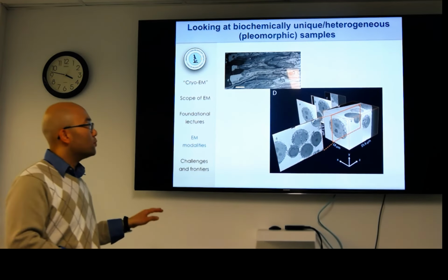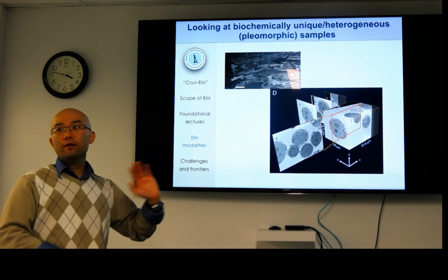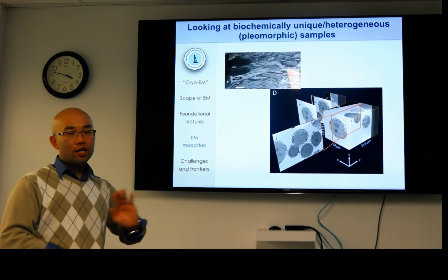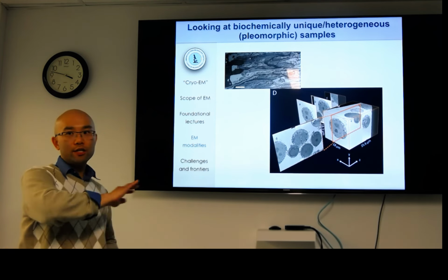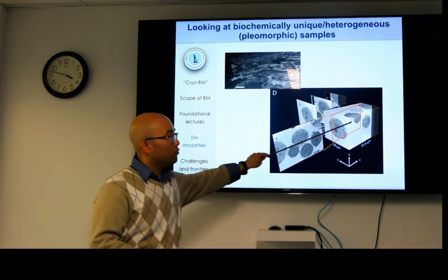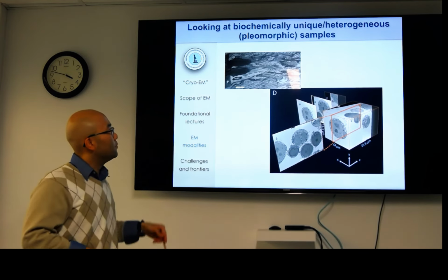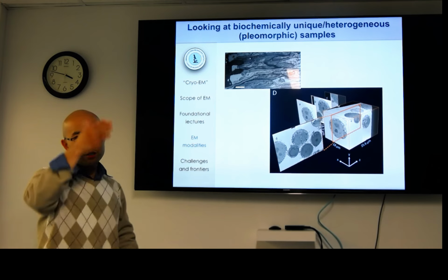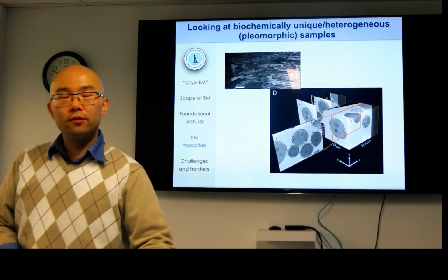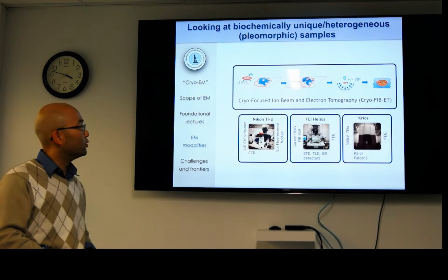So that's classical tomography. As I mentioned, dual beam FIB-SEM is really using one beam, an ion beam, to cut a little bit of a layer off, shave a little bit off of a block, and use the SEM to image that. And then you can get a 3D reconstruction because you're just marching through a volume and scanning in. And you can see here in this movie, your resolution is limited by your XY, and then your Z is how thick you're slicing. But a lot of the sample processing and data processing techniques between these two methods are quite similar.